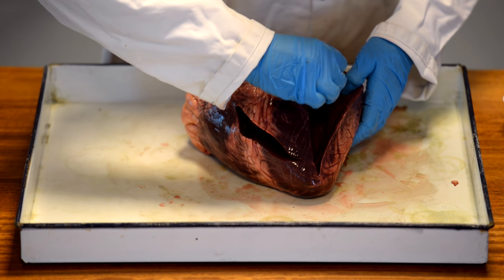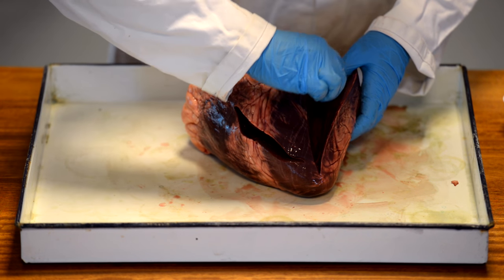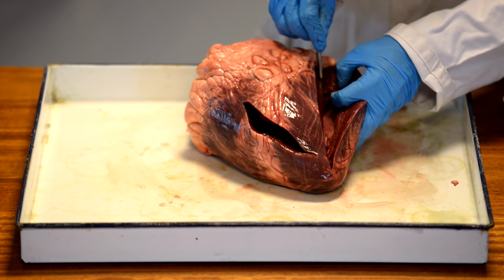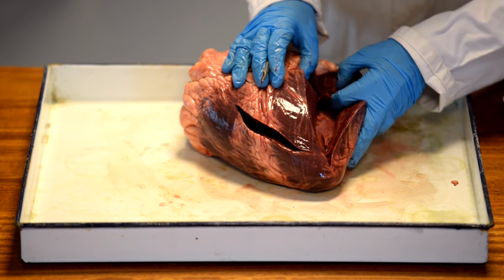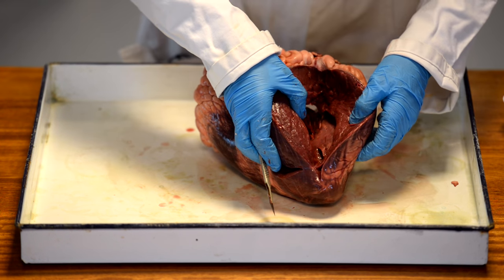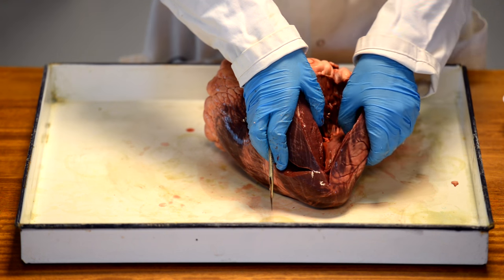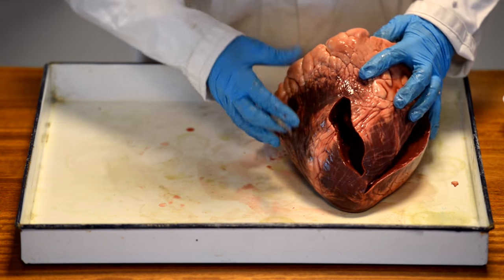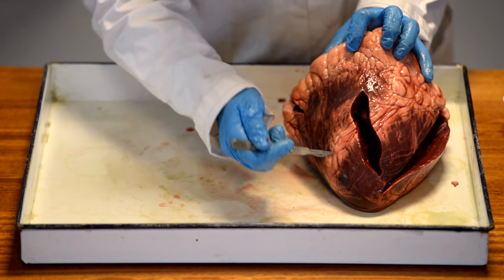I'll actually take it right up here, so I take some of the tension out. There we go. With brush strokes, very careful not to cut your fingers off. There, now, what you're looking into now is the left-hand side of the heart, the major powerhouse of the heart. So let's go down the other side. We go down the other side towards the apex.